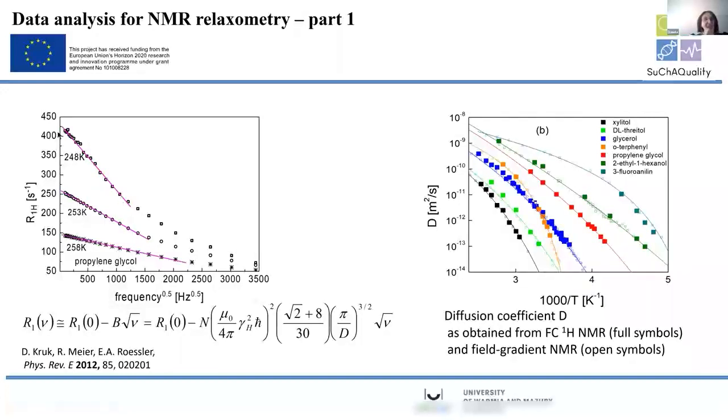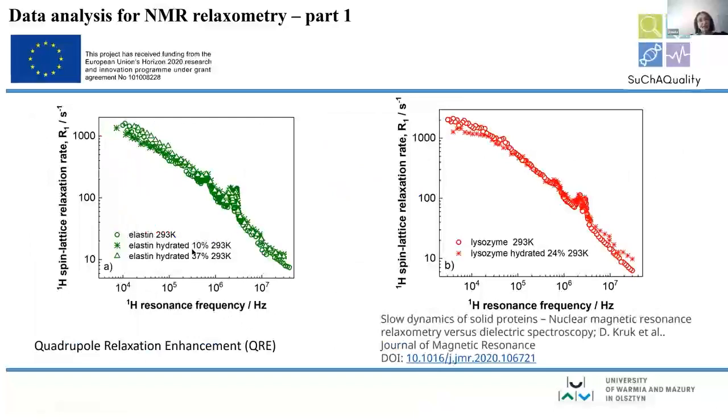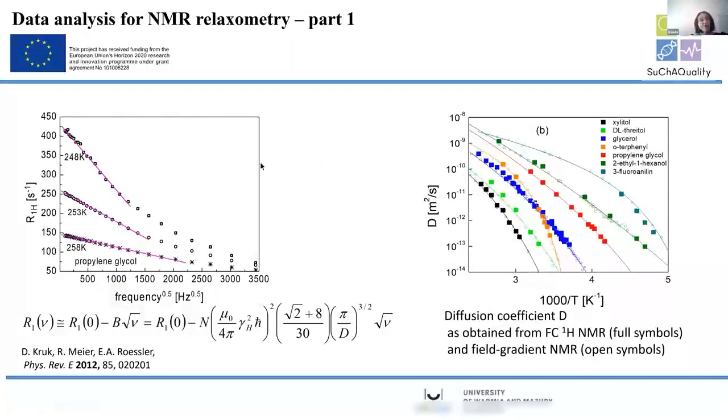So you perform linear regression, and from that you can get the translational diffusion coefficient. And this is what I will show you in a second. And we did such a thing for, this is a kind of complex expression. Okay, give me a second, maybe we'll see how it works. It's maybe worth putting this expression somewhere. Actually, I will make the whole presentation available to you. But it would be good to have it somewhere. I will think how to solve it in one screen.